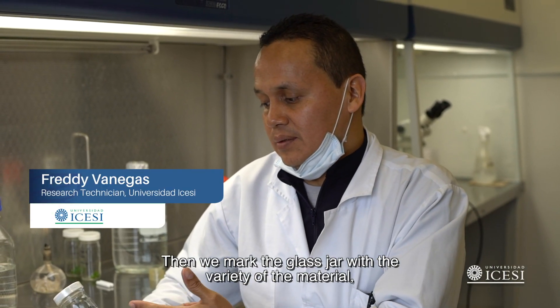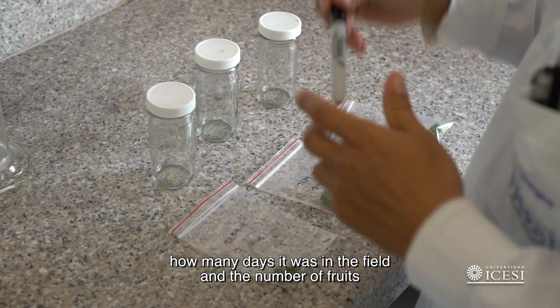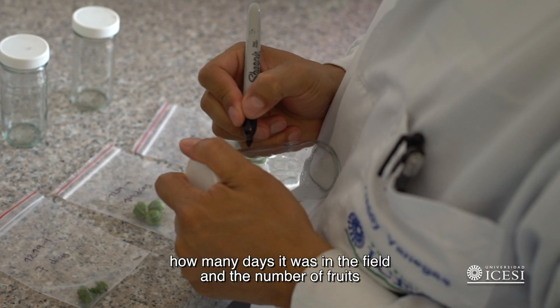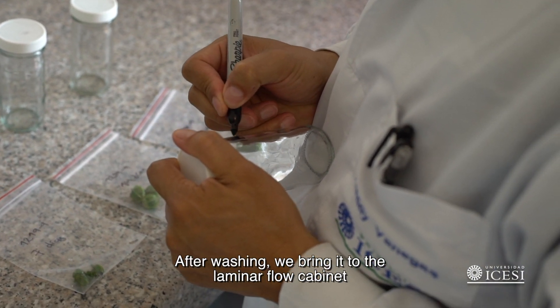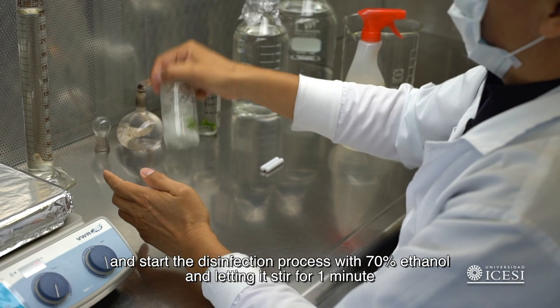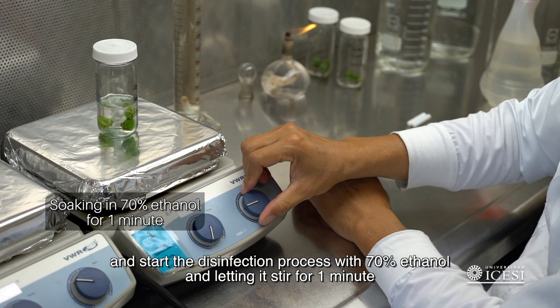The quality of the material depends on the variety, the days in the field, and the amount of fruits. After washing, we bring it to the flow cabinet and start the process of disinfecting with ethanol at 70%, agitating for one minute.